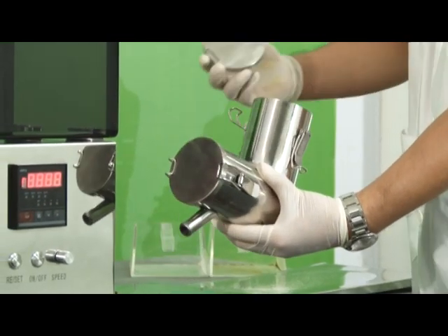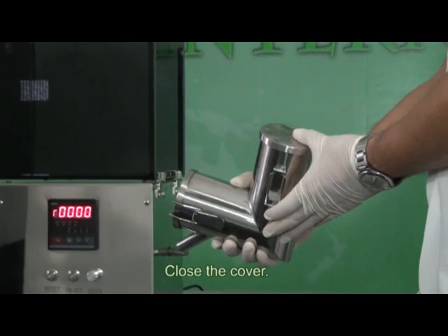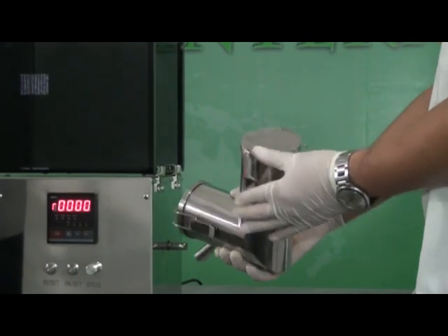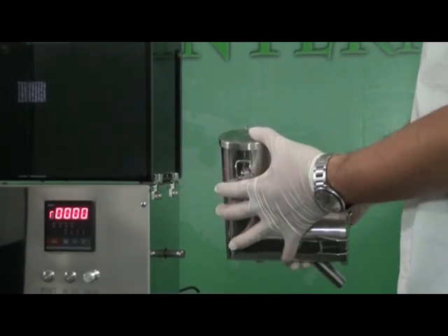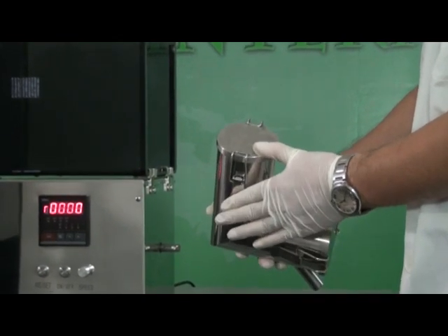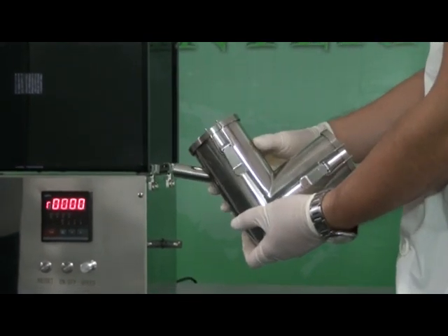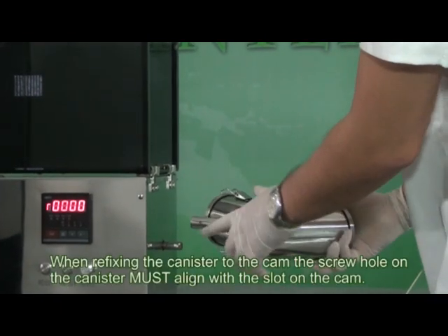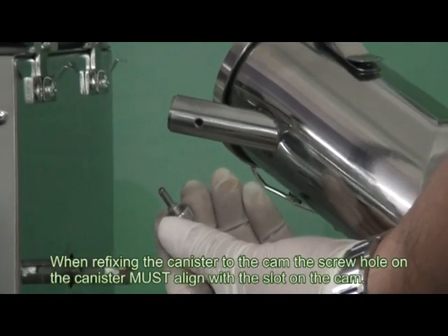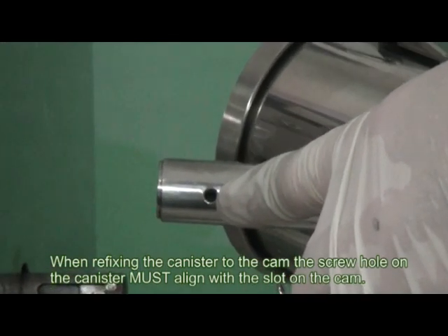Reattach the cap to the canister, then fit the canister to the cam. The screw hole on the canister must align with the slot on the cam.